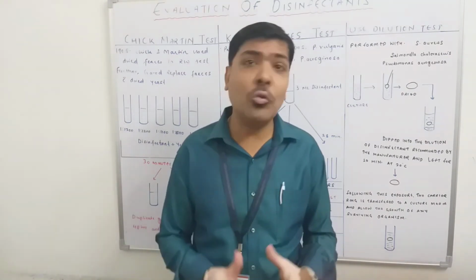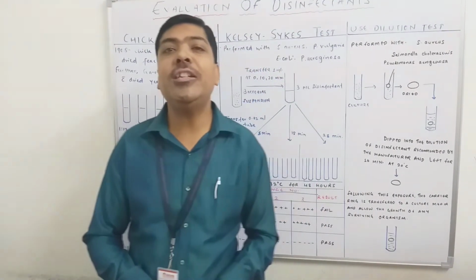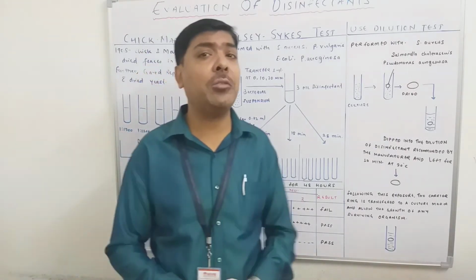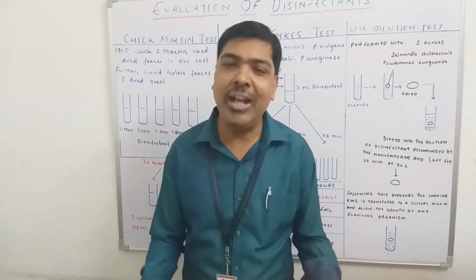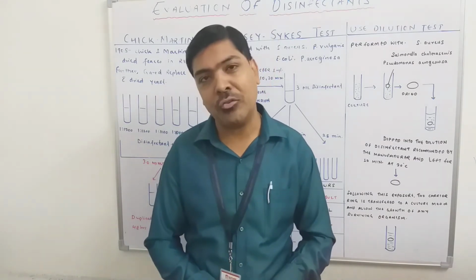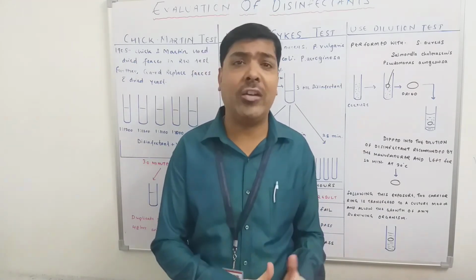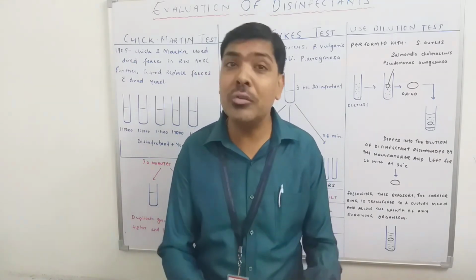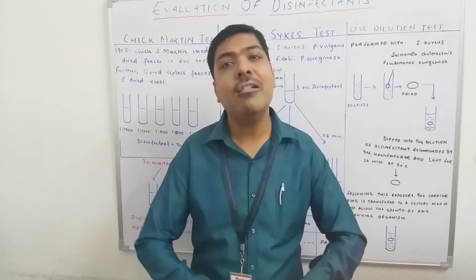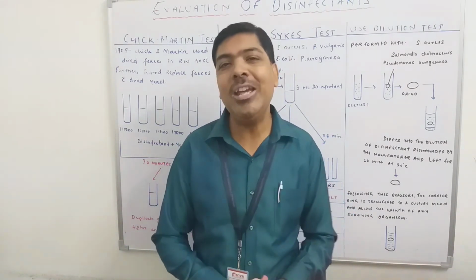And if no growth is observed after the incubation, then we can say that the chosen dilution, the one claimed by the manufacturer, is correct, and the microorganisms have a lethal effect because of the chosen disinfectant. It means the manufacturer's claim is correct. Now we can use this particular disinfectant on a larger scale, maybe in any pharmaceutical industry or hospital.